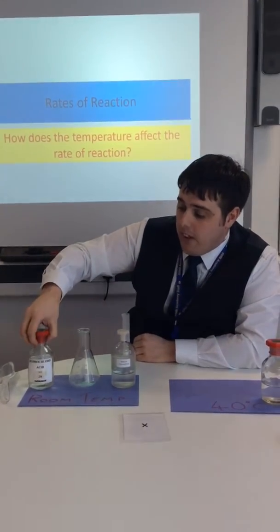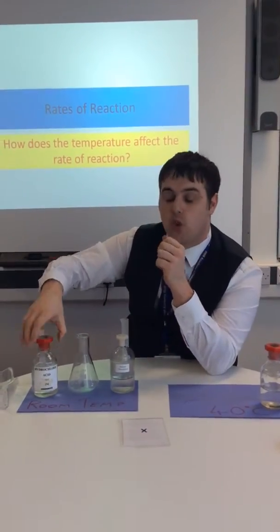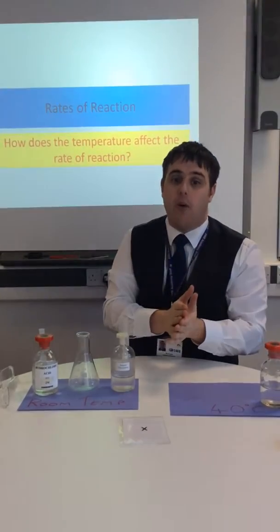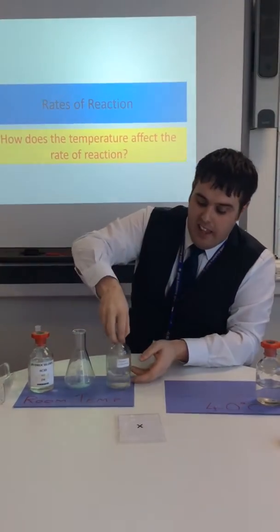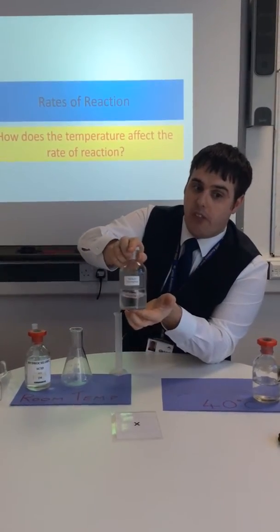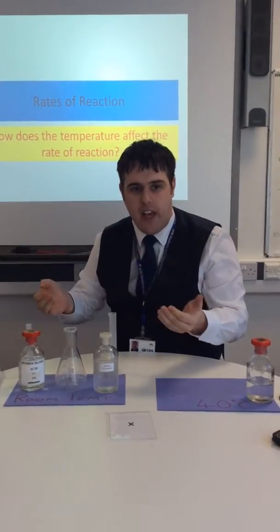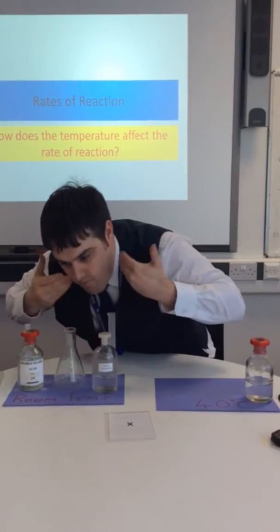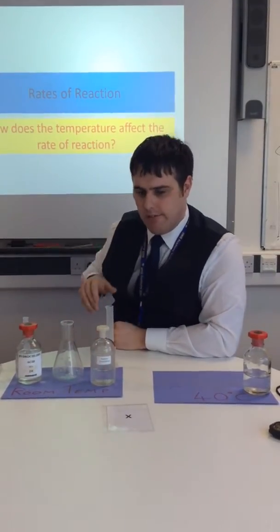What we're going to be working with today is some hydrochloric acid. Now this is corrosive, so try not to get any on your skin, but if you do, wash it off straight away. We've also got some sodium thiosulfate. This isn't so bad, but when you mix the two together, it can produce just a little bit of sulfur dioxide, so don't go huffing that in, otherwise it might make you feel unwell.